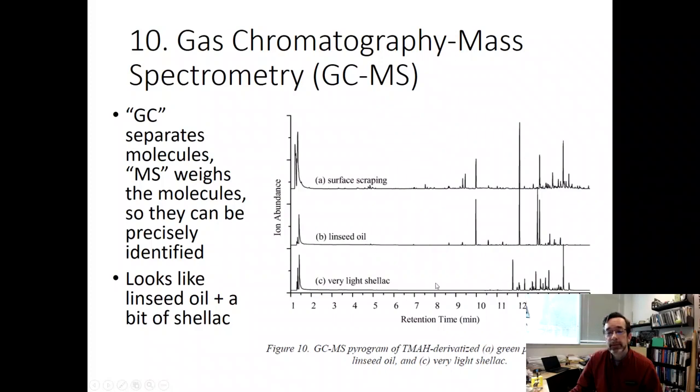And then you also see that you have a shellac, and they found a shellac that they ran through the GCMS. They got this fingerprint, and it seems to match in the major peaks as well. At least this peak at 14 matches, the peak at 13 matches. There's a peak at 11 that doesn't match, and you've got to realize that there's always going to be something that doesn't match. But overall, it looks like a pretty firm case that GCMS is picking up the linseed oil in another way, and it's also picking up the kind of shellac that they used.